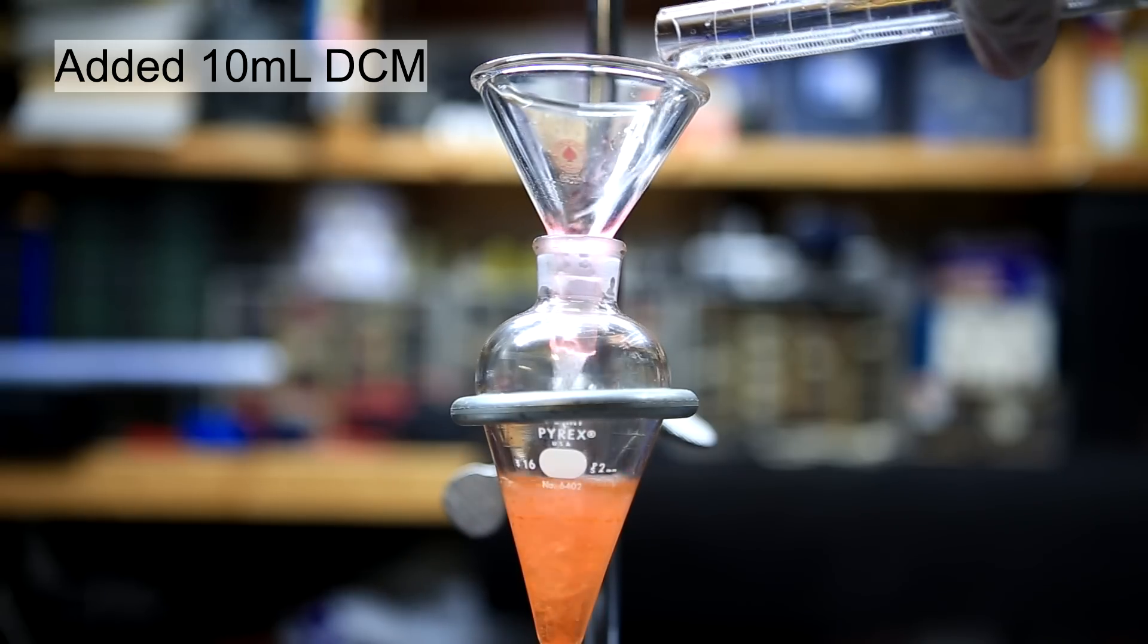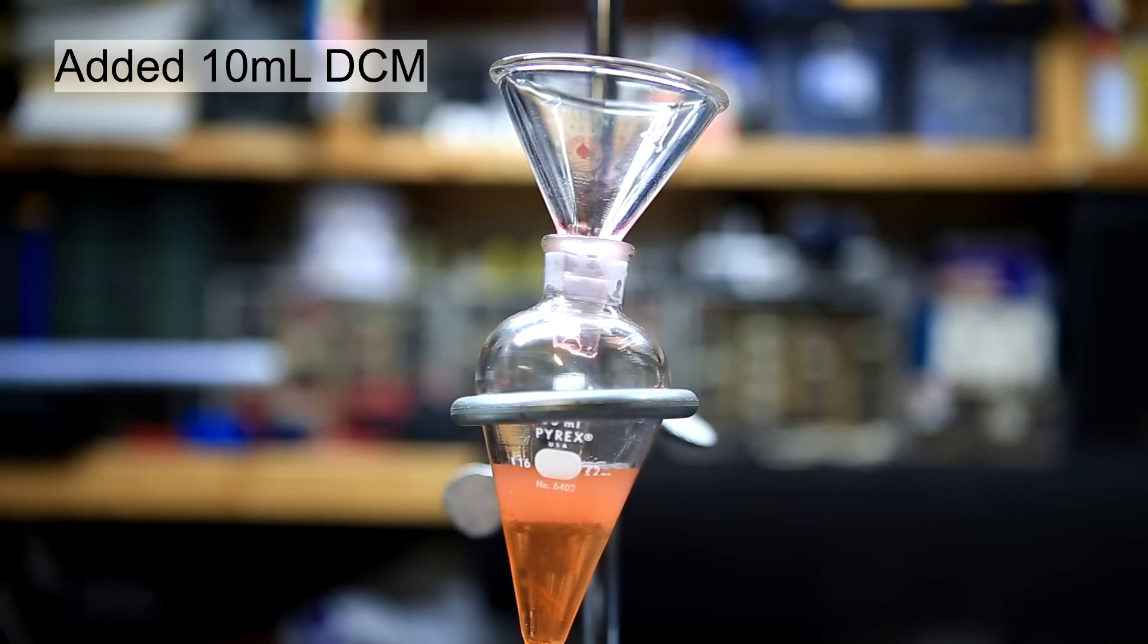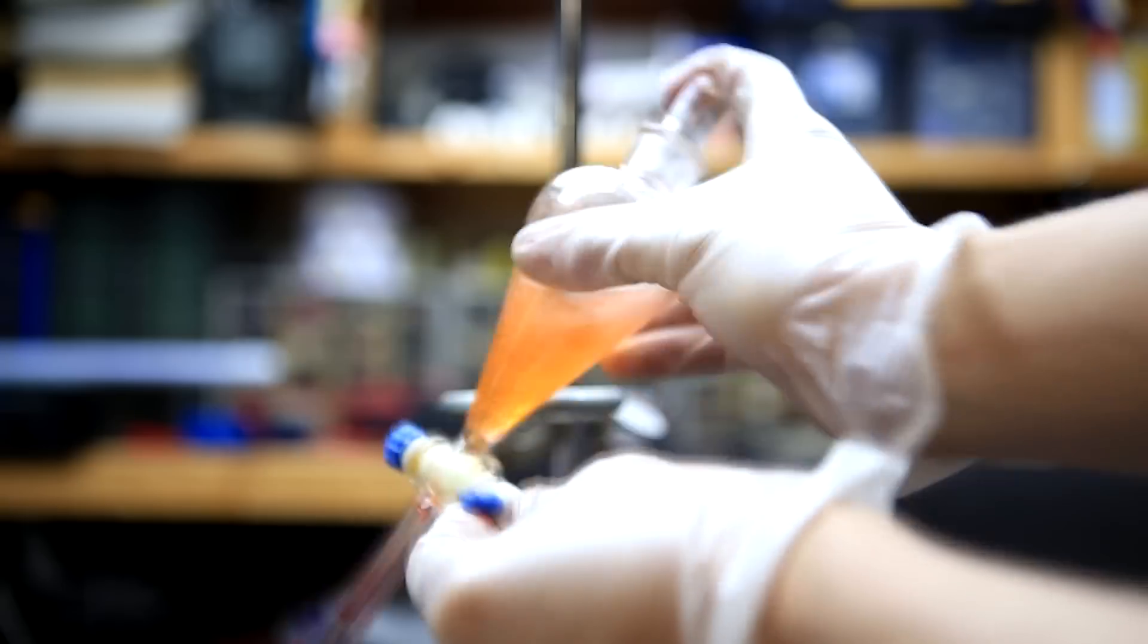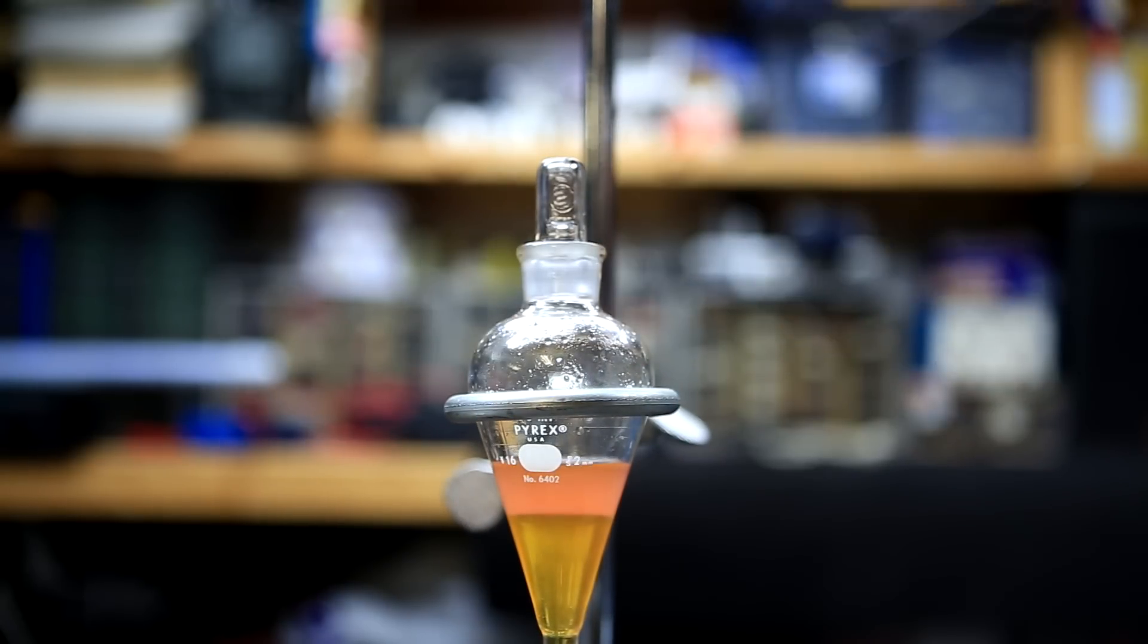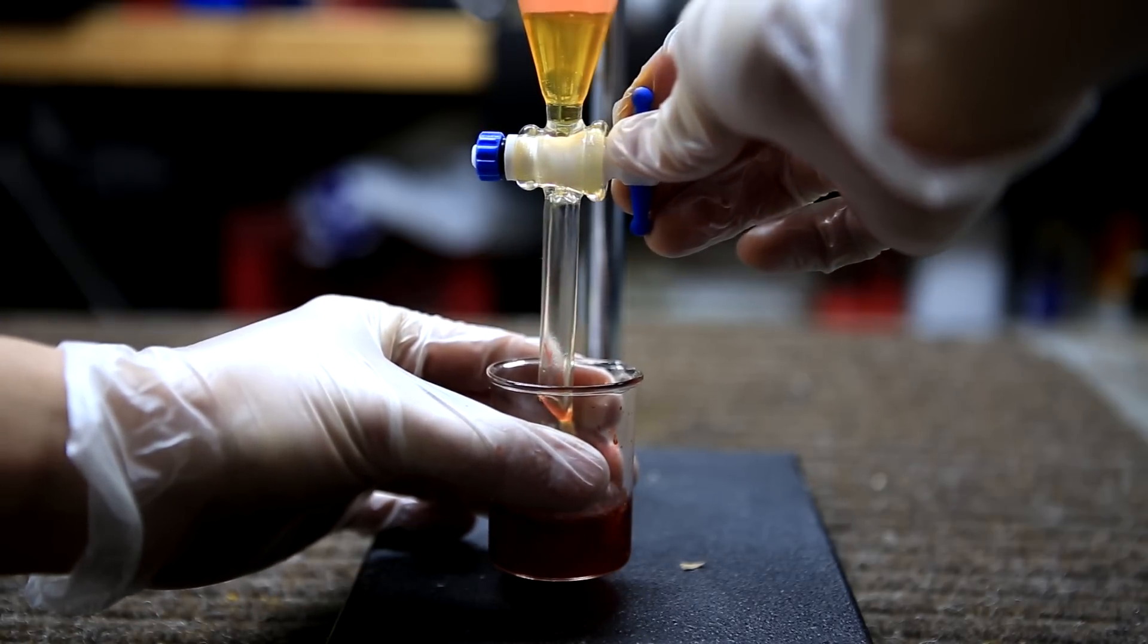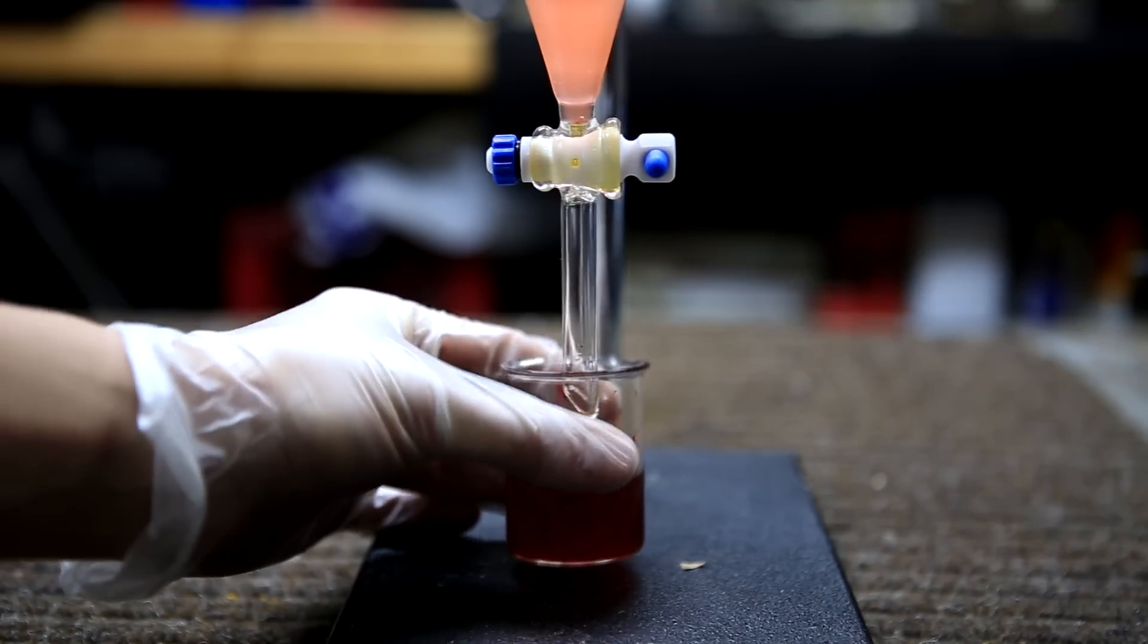Then, 10 more ml of DCM is added to the aqueous layer in the separatory funnel. Again, the separatory funnel was capped, shaken, and vented, and then the layers were allowed to separate. This time, the lower DCM layer is yellow and not a dark red, indicating that there is much less phenolphthalein present.